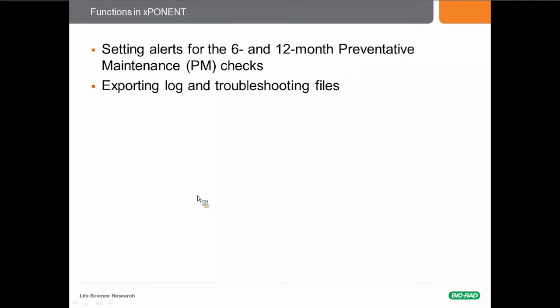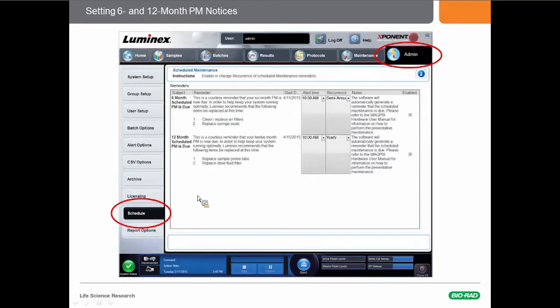While the Bioplex Manager NP software automates most of the functions in the underlying Exponent software, there are some functions which still must be handled via Exponent. These include setting alerts for the 6- and 12-month preventative maintenance checks and exporting log and troubleshooting files. To reset the preventative maintenance alerts in the Exponent software, click on the Admin tab and then Schedule. On this page, you can set the start date — which is the date of the most recent PM — the time the alert should be given, and the recurrence, which is how often the PM should be done and the alert issued. The instrument log and troubleshooting files may be requested by technical support; if needed, technical support will provide more detailed instructions on accessing them.